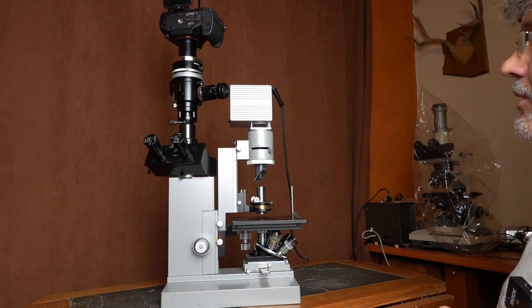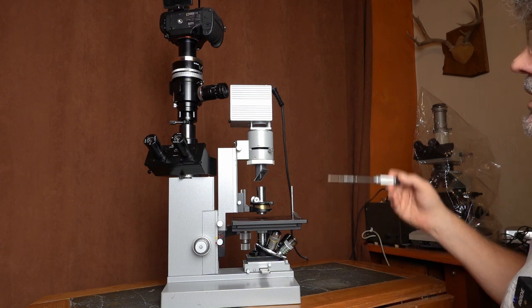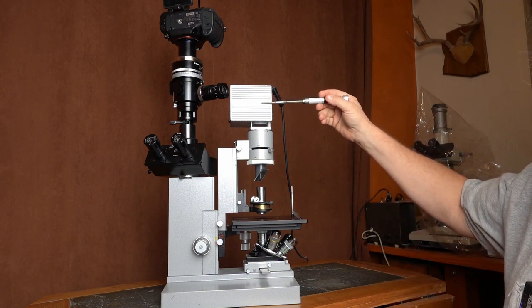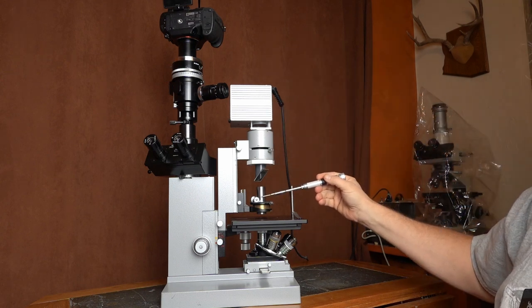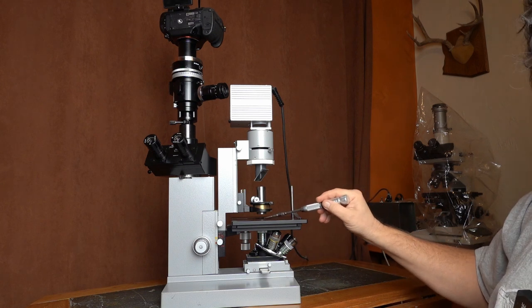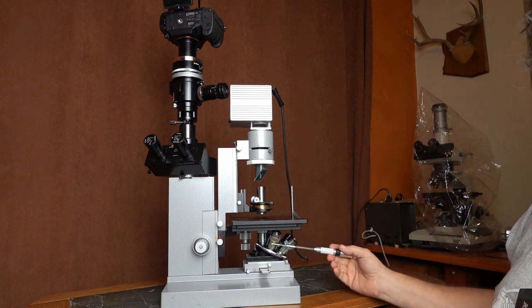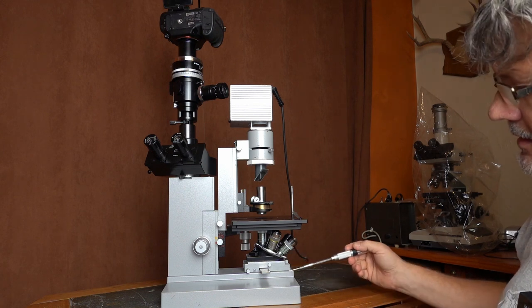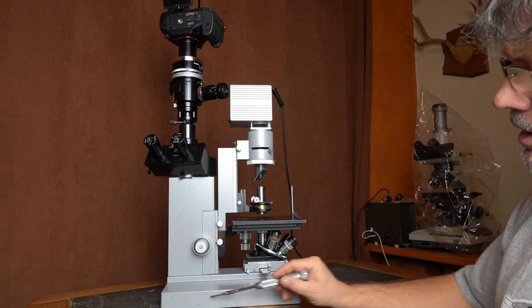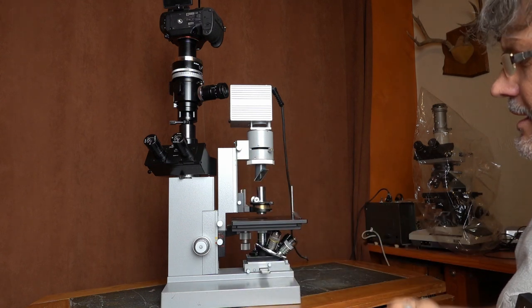The first thing you'll notice is that it's an inverted microscope, so the light source is here, the light comes down through the condenser. Your slide goes on the table here, and the objectives are below the table. The light then comes down, goes along here and up to where the eyepieces magnify the image formed by the objectives.